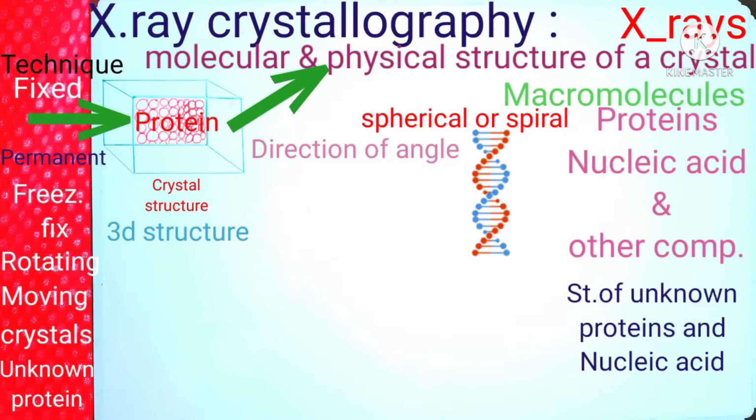When X-rays hit this crystal, they go towards the crystal, interact with the crystal, and then are diffracted at a specific angle. It depends upon the type of probe molecule. When we are analyzing the diffraction pattern, it varies, and this diffraction pattern is unique for different types of molecules. If the molecule is more complex, then there will be more varieties of diffraction, which we will learn later. And if it is a simpler molecule with very few regions, if most regions of the crystal are blank, then it will give us less diffraction.